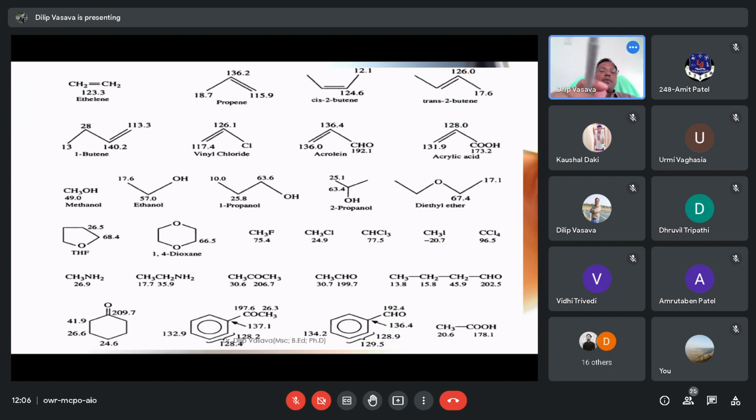You can calculate the carbon value of each carbon by using the delta formula. So this is 13. Now there are two substituents, so this carbon value is 28. Now this is the sp2 hybridized carbon atom, so the values are high. Here I just wanted to mention that this value is 66 because the carbon is attached to an oxygen atom, so it has only one value.